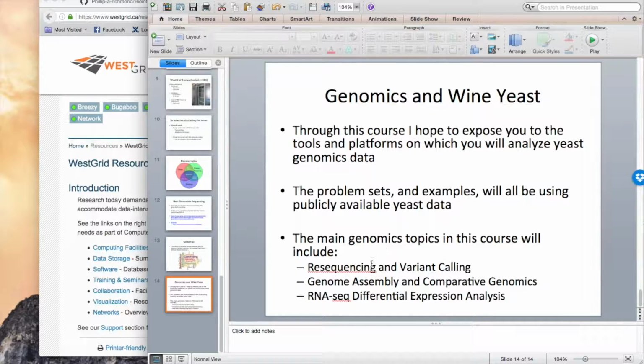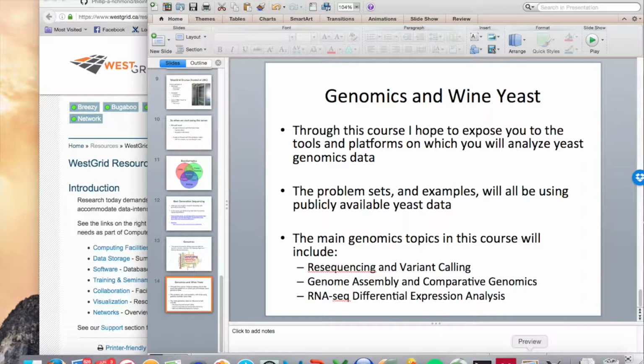So the topics that I will cover in this course include resequencing and variant calling, genome assembly and comparative genomics, and RNA-seq differential expression analysis. That concludes the presentation for section 1-1.